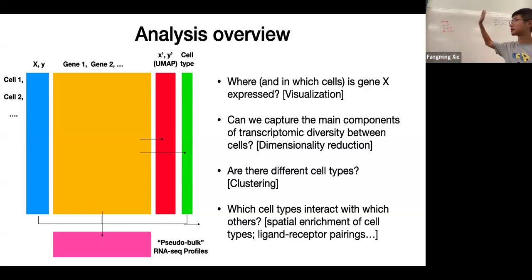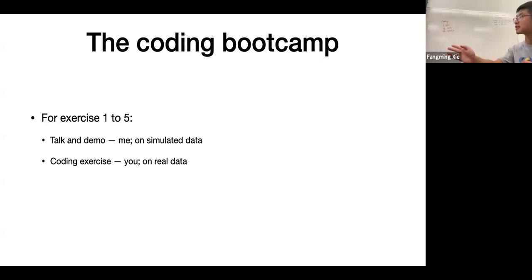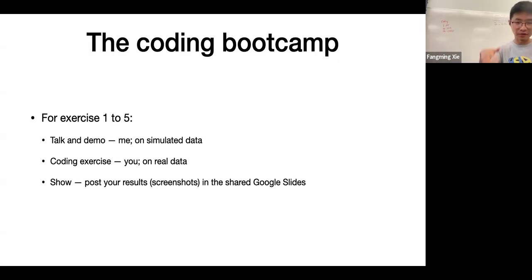Okay, so that's an overview that covers today and tomorrow, 5 different exercises. So we will be doing a coding boot camp for today and tomorrow. For each exercise, think about it as a workflow, a for loop. We loop between exercises. First, I will show you a demo or some talk, usually me talking about the concepts or showing you how to code on simulated data.